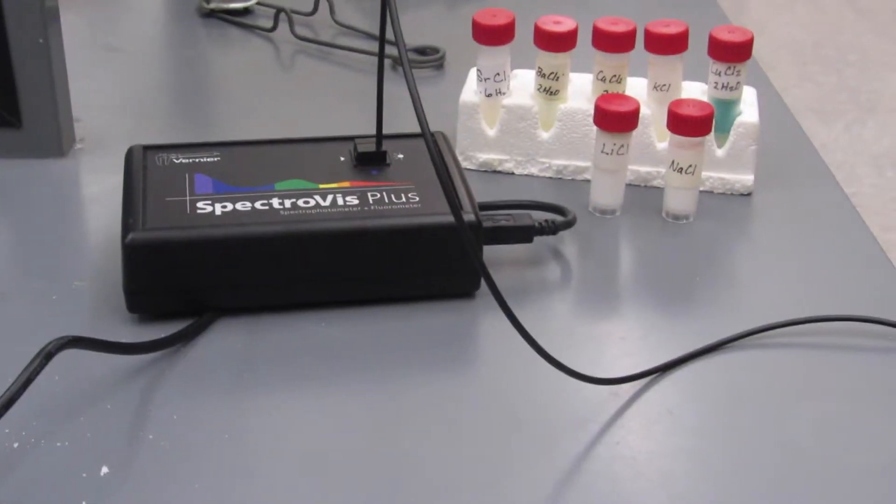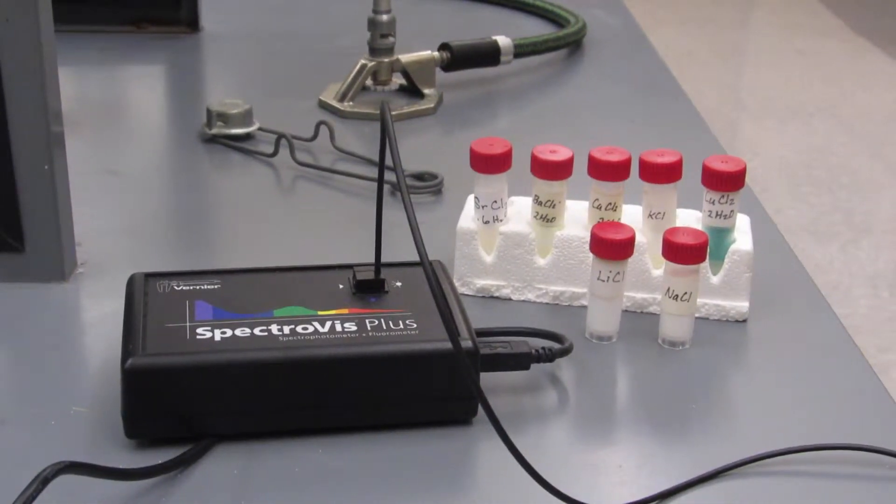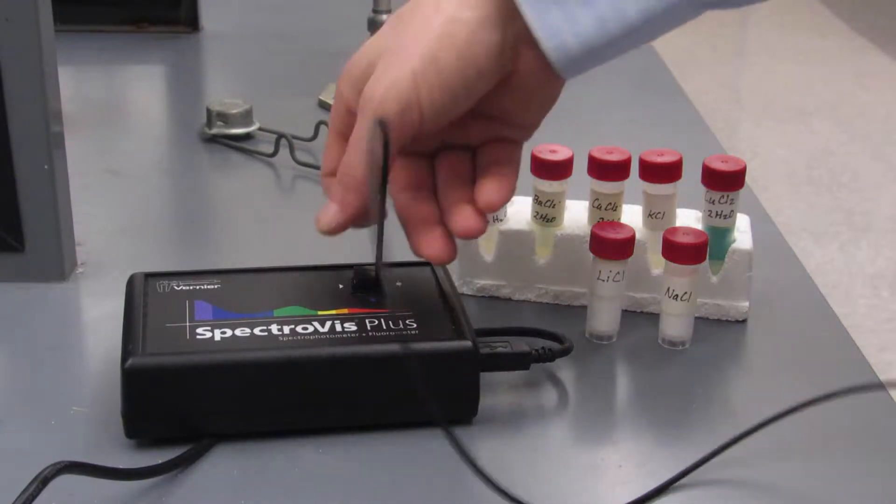In this video, we're going to take a bunch of metals and stick them in a fire to see what color they turn. To record the wavelength of the photon each metal produces, a spectrophotometer made by Vernier is going to be used.